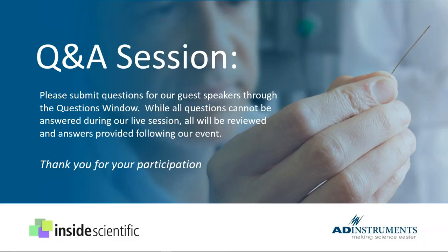The other, if you want to use the more curvilinear logarithmic approach, I think that paper I mentioned by Burkhoff, Mirsky, and Suga described their techniques that are published, where you can actually fit parabolic or logarithmic fits. Then you wouldn't so much extract one number, but you would use that entire regression and that entire relationship to compare from animal to animal, and that's fairly robust. You can also transform your data. You can do a linear transformation, almost like a stress-strain analysis, and linearize the logarithmic curve offline, and those relations are very linear. And you can apply fits to that linear regression.